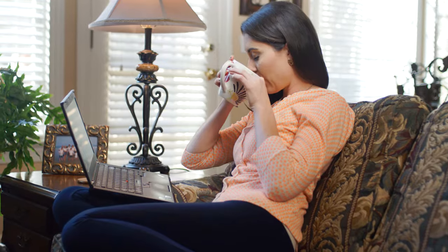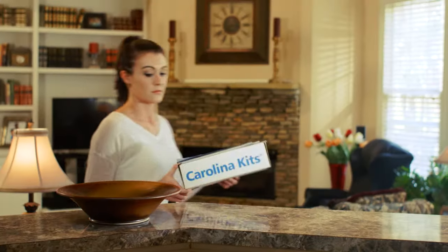Kits are shipped quickly so students can start their labs when you are ready to start your course.